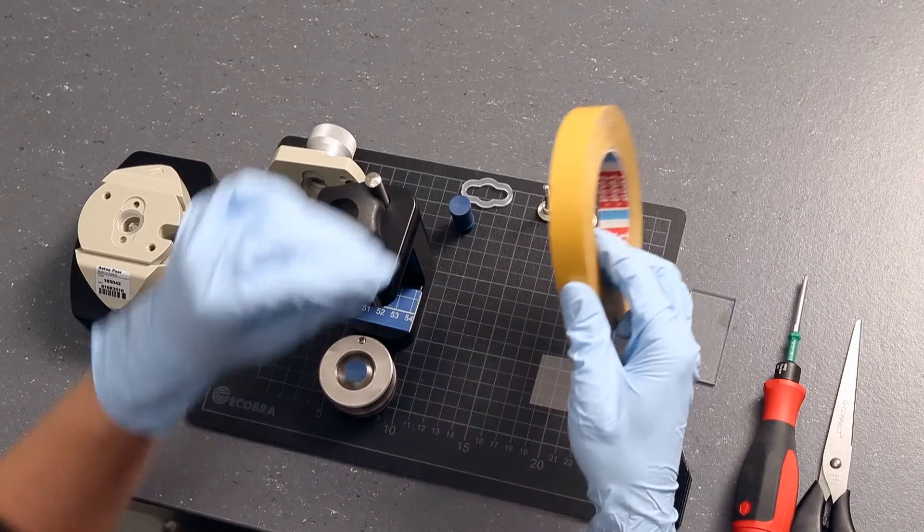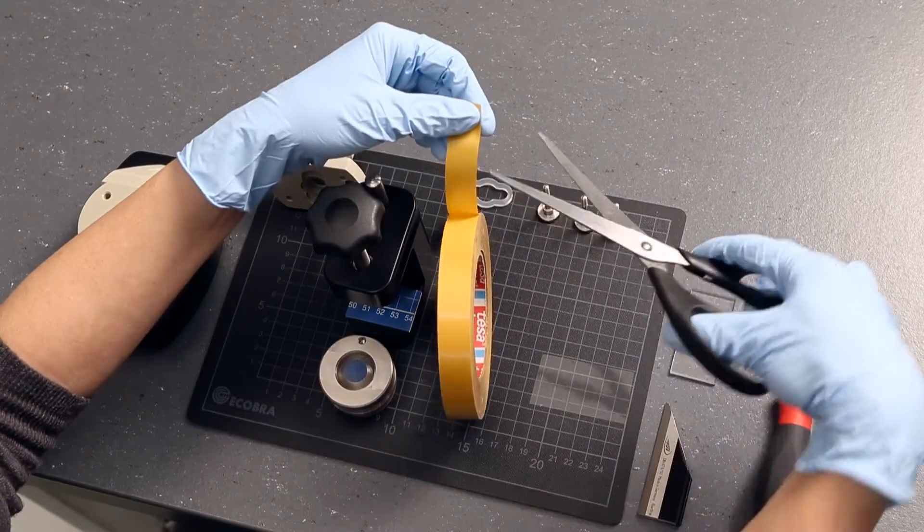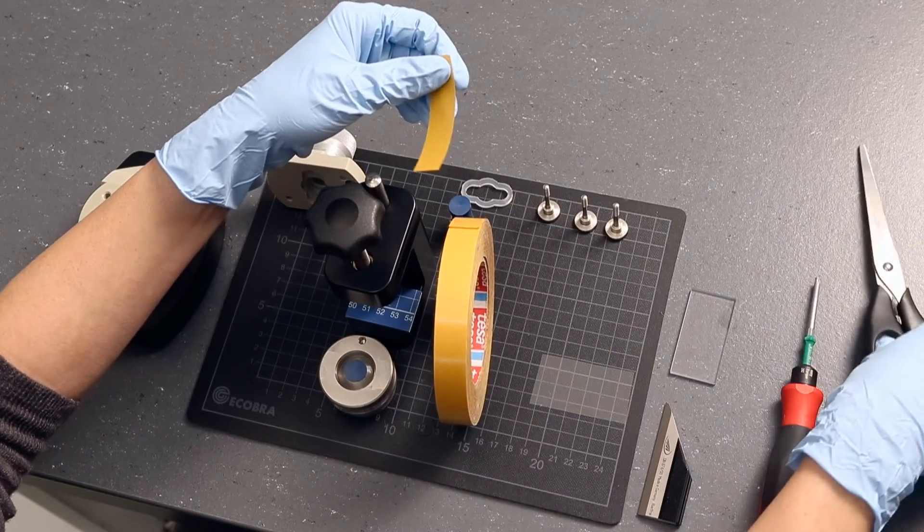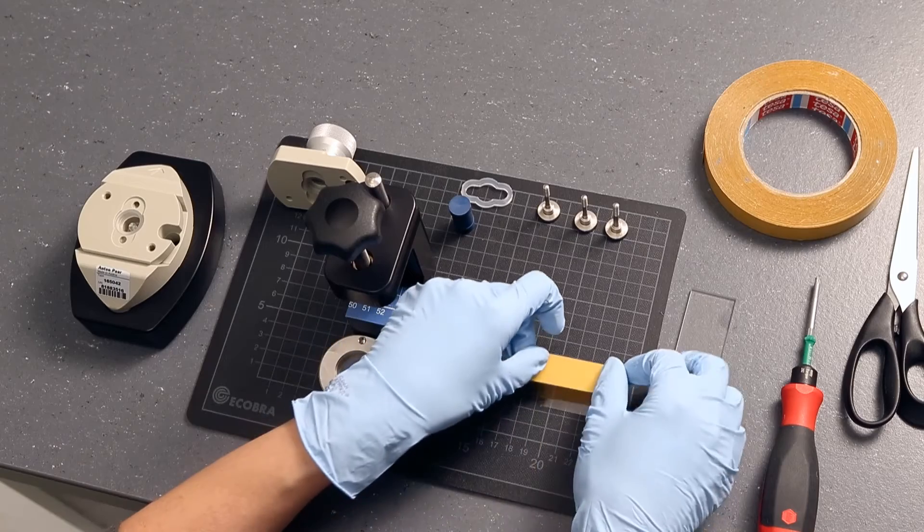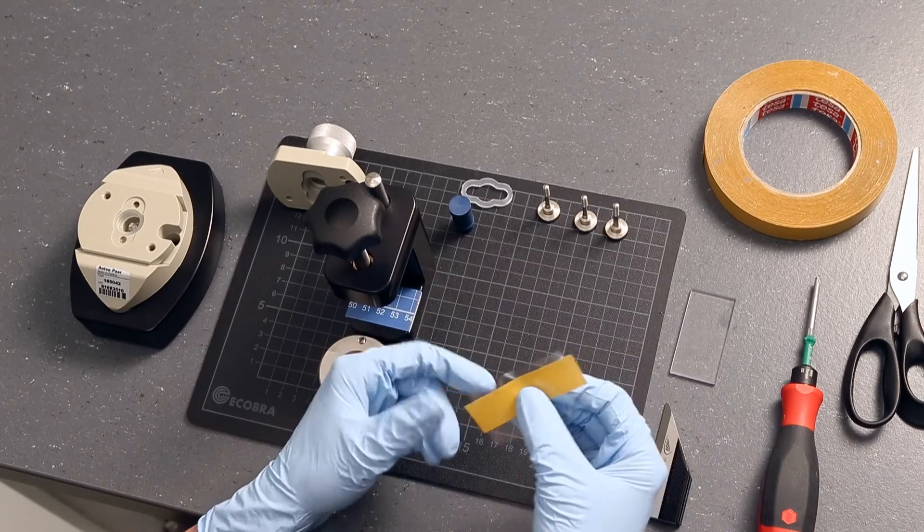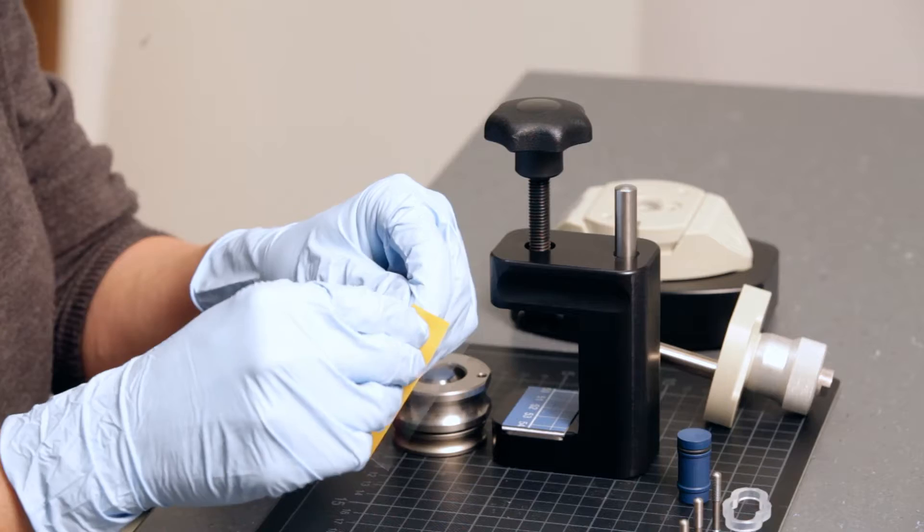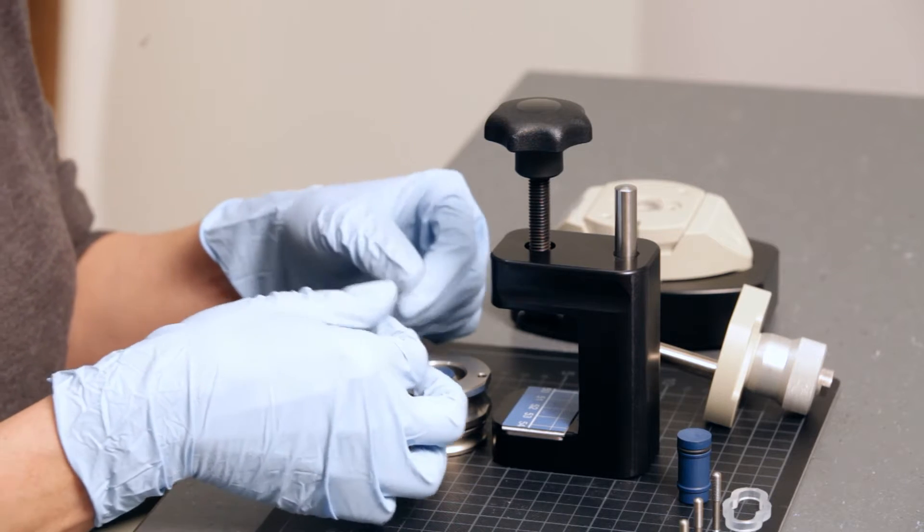Cut out a suitably sized piece of adhesive tape and place it on the backside of the polymer foil. Now use the puncher. Peel off the protective cover and stick the tape onto the sample holder.